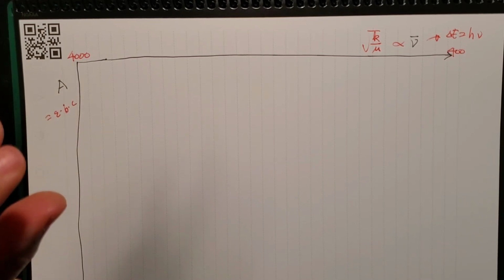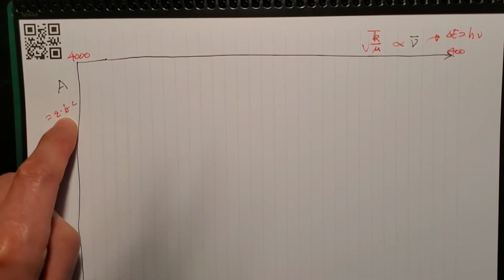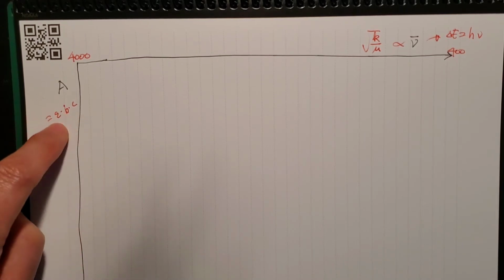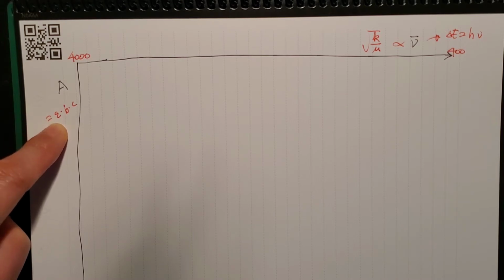You have a sample, and the sample concentration is the same, but within the sample you could have many of the same functional group. Then the functional group concentration is higher, multiples of the concentration of the compound, and the sample cell size will be the same, but the absorptivity will be different for each functional group.